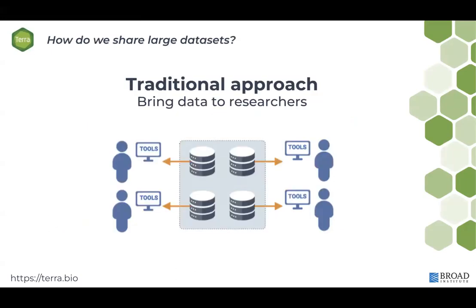So we like to start by explaining the difference between the traditional approach and the cloud-based approach that Terra is built for. So first, if we consider the traditional approach, we have to imagine that everybody in the world is coming to get their data and take it to their own computers.